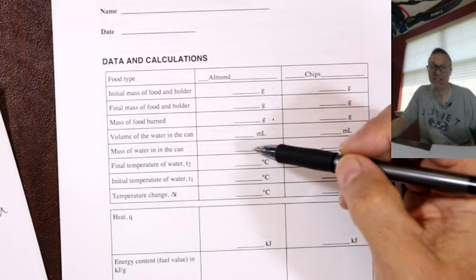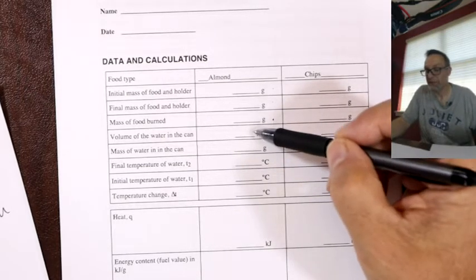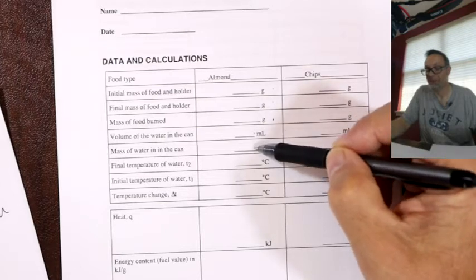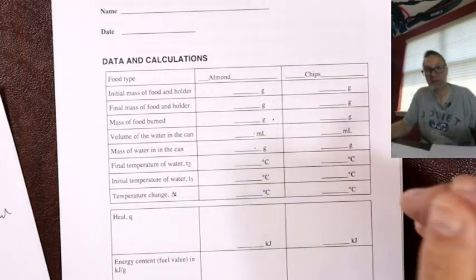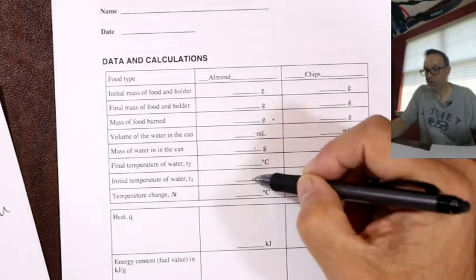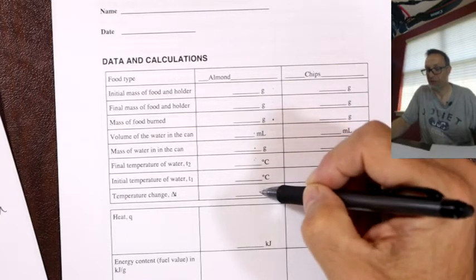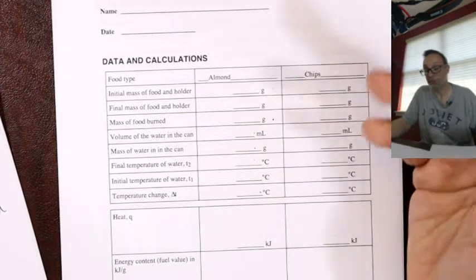Should we do this in lab, I'll actually have you go off script and just weigh it directly, but they want you to work out from the volume of the water in the can what the mass is. So say it was 50 milliliters, it'd be right around 50 grams with all the sig figs, right? Then you measure the temperature of the water before and after the food's burnt, subtract for the change in temperature. Okay, so that's all the information you need.